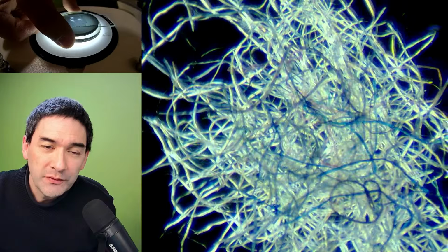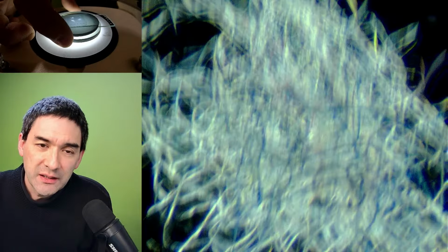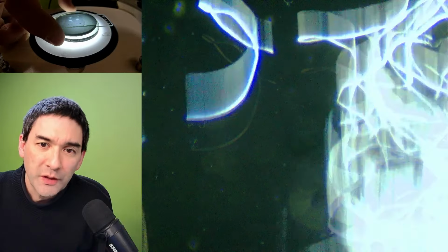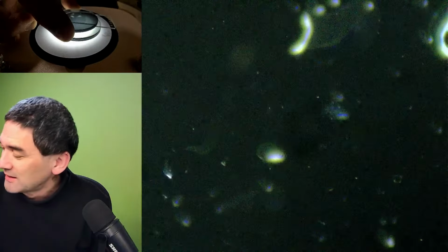One of these things is that, because I've got a camera connected, it always readjusts the exposure. So you see that some parts are a little bit overexposed. The image quality as you look through it, of course, is much nicer. See now it kind of sticks. The slide sticks to this here.